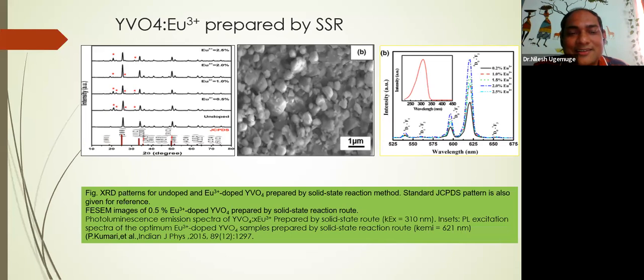No meaning? Okay. Arbitrary unit. Arbitrary, but arbitrary. Because we are not trying to show whether the intensity is 100 or 1000 or whatever it is. That is why we are writing arbitrary unit, because we are just trying to compare only the 2 theta values. We are just trying to match this peak.